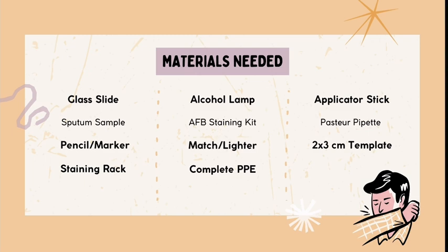Your Bartlett's criteria is a criteria wherein you are going to accept or reject the sputum specimen, because you do not know if the sample submitted by the patient is not a sputum but instead a saliva.